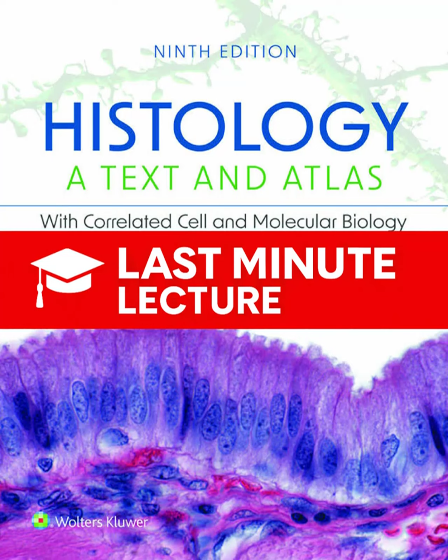And the visual effects, which we can actually see in Figure 1.1, are incredibly informative. They are. If you look at a section that's only stained with hematoxylin, you see this heavy blue or purple staining. And it's all concentrated in the nuclei and in the RNA-rich parts of the cytoplasm. Those are the basophilic components, right? The base-loving ones. Exactly. Now, in contrast, if you look at the slide with only eosin, the general cytoplasm and the matrix fibers outside the cells are all stained pink or red. The acidophilic or acid-loving parts. Right. And the nuclei are actually really hard to see with just eosin.